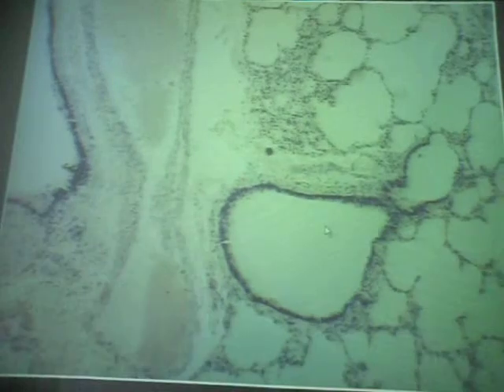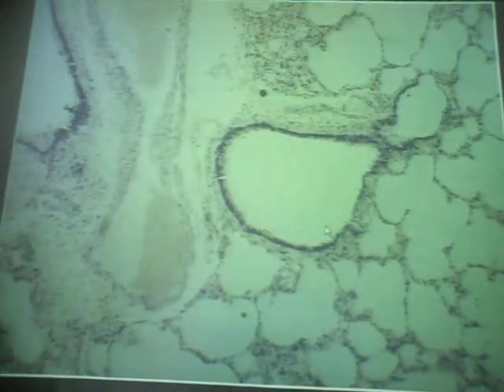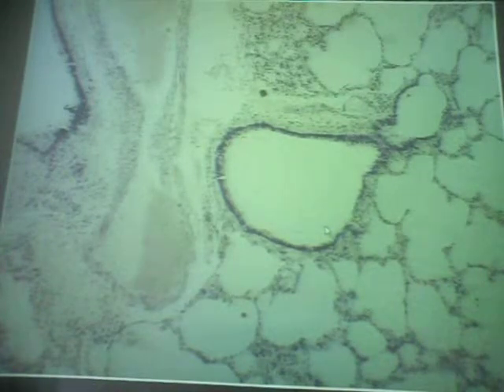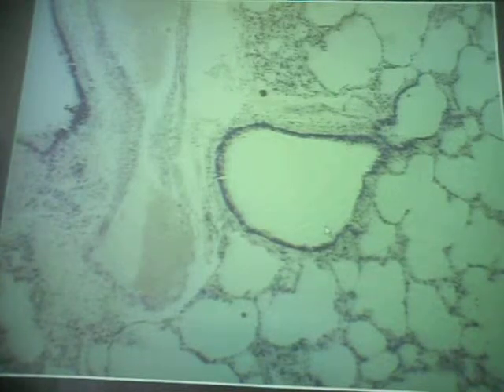Okay, we got a couple more respiratory passageways here. All right. Now, you first look at the respiratory passageway. Does it have cartilage? Cartilage, tertiary bronchus. No cartilage, then you've got several choices. It's a bronchiole, it's a terminal bronchiole, or it's a respiratory bronchiole. None has any cartilage in the wall. So your next question is, does it have any alveoli coming off the wall? If it does, it's a respiratory bronchiole.